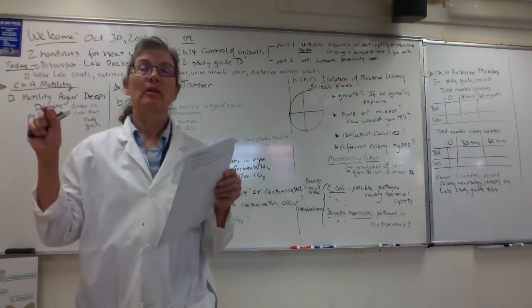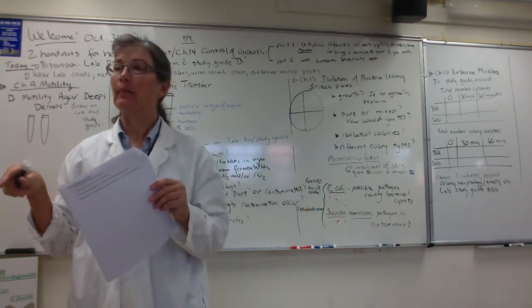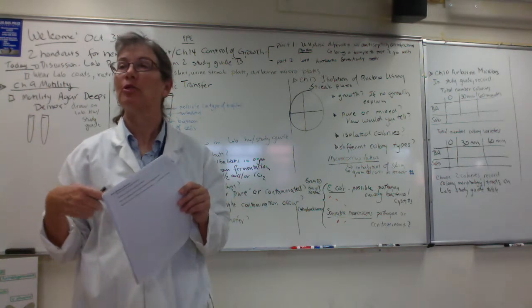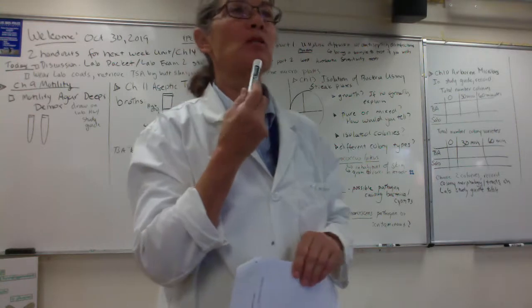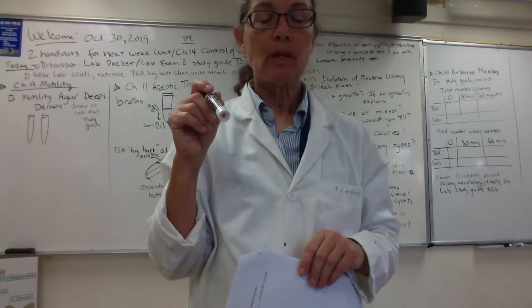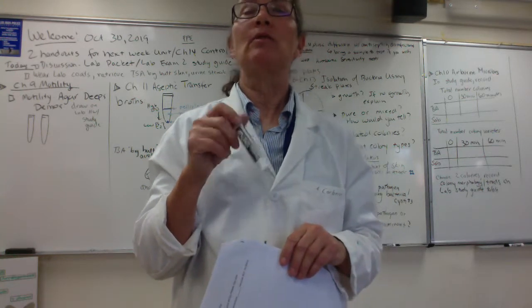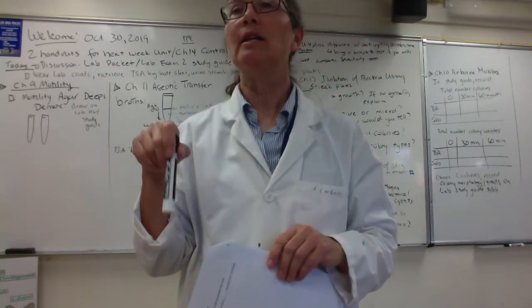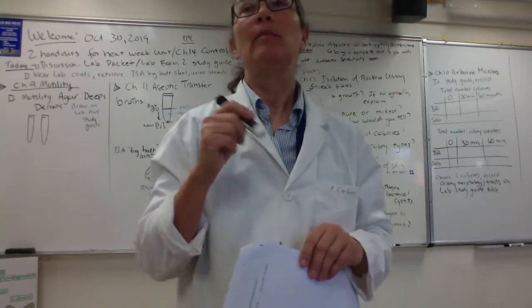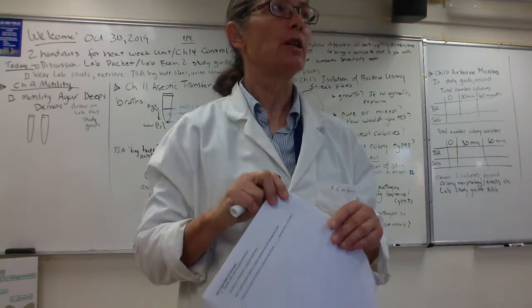What I want you to think about is when, during that process, your culture could get contaminated. Think about where along the way could I have contaminated my culture. Maybe that could be a possible lab exam station. We'll have maybe 2 or 3 either plates or slants, and we'll ask you if you think they're pure or contaminated. And if one of them's contaminated, we'll ask you to explain how it may have become contaminated, right? We'll usually just ask for one or two possible explanations, right?